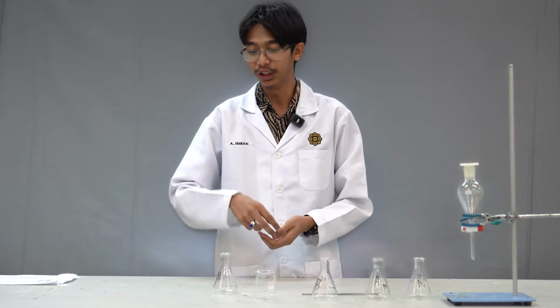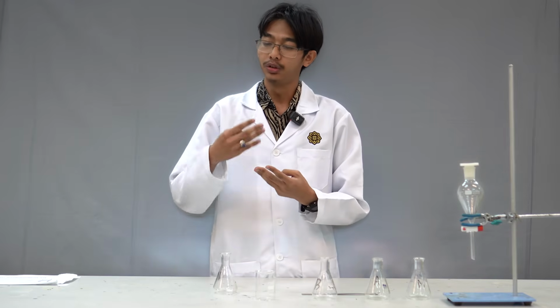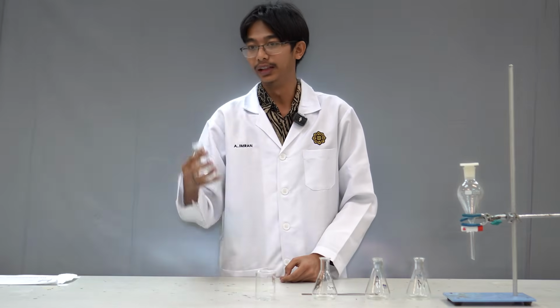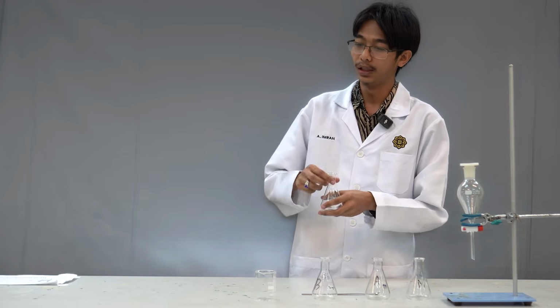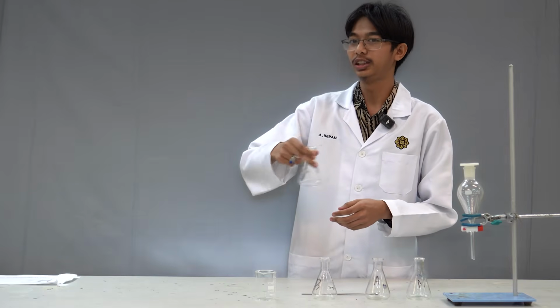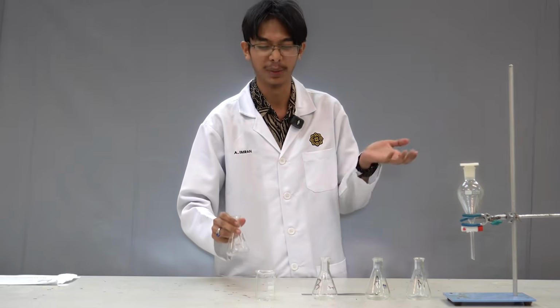Our liquid mixture is going to be composed of powdered acid, powdered base, and powdered neutral. Of these, you're going to take 0.2 grams of each and put it in this mixture flask, and then add 10 milliliters of DCM into the flask and mix it together. You just shake it up until everything is as well mixed as possible.